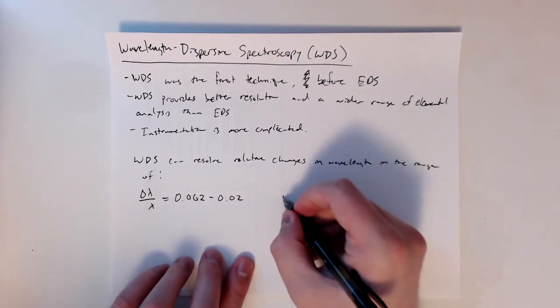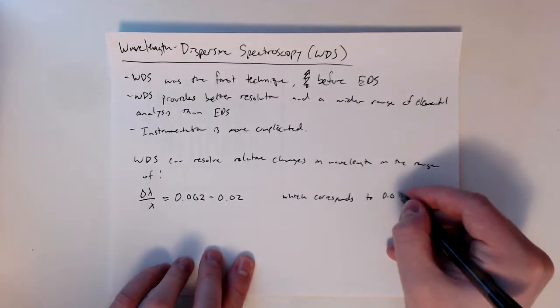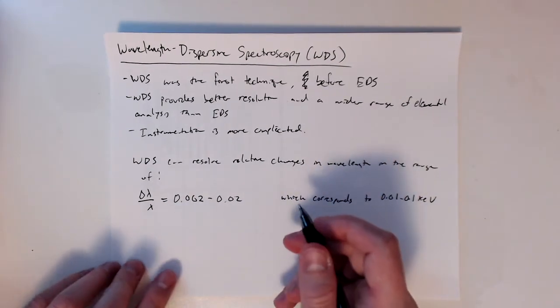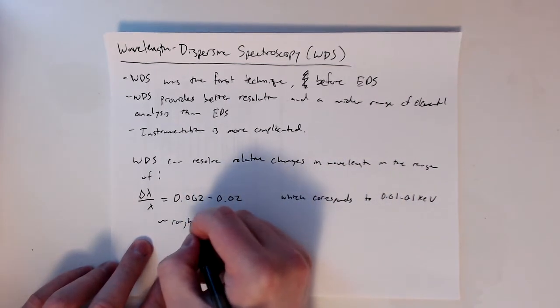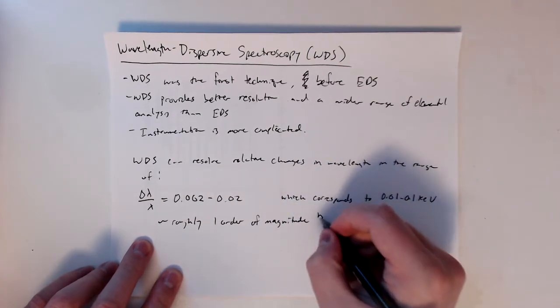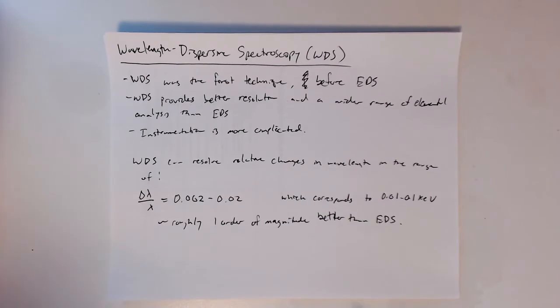This corresponds in terms of energy to 0.01 to 0.1 keV. And that's your reference to EDS. So effectively, this is approximately one order of magnitude better than EDS. That's something that's definitely going to come back when we talk a little bit more about EDS as well.